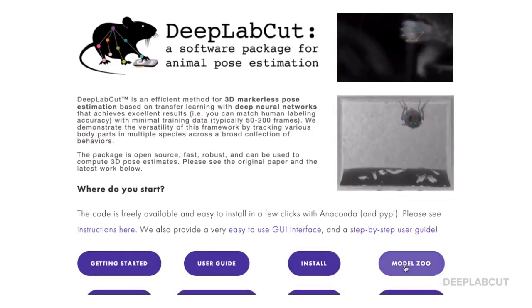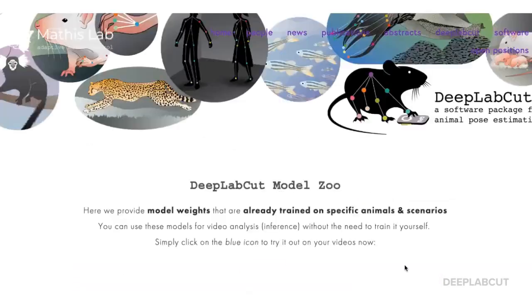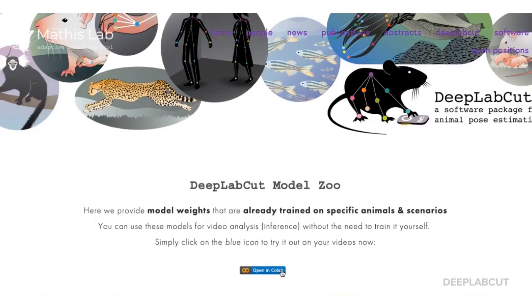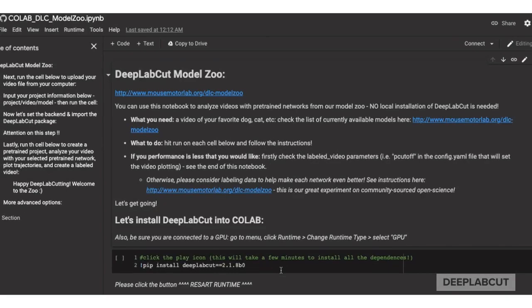Welcome to the beta release of the Deep Lab Cut Model Zoo. In this video, I'll show you how to use Google Collaboratory to analyze your dog or cat video in under 5 minutes.